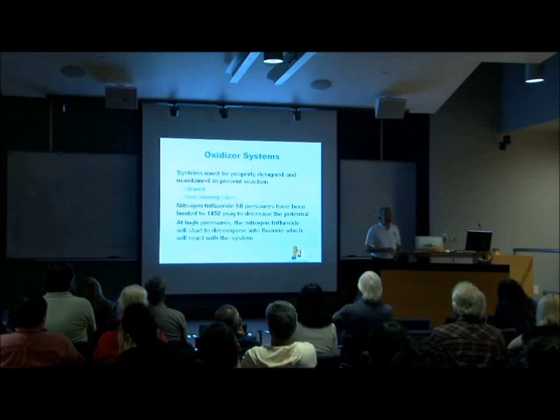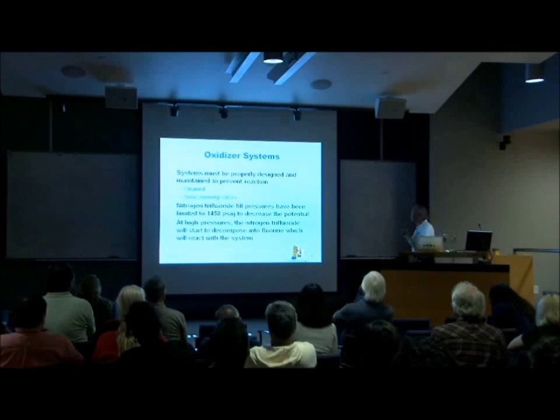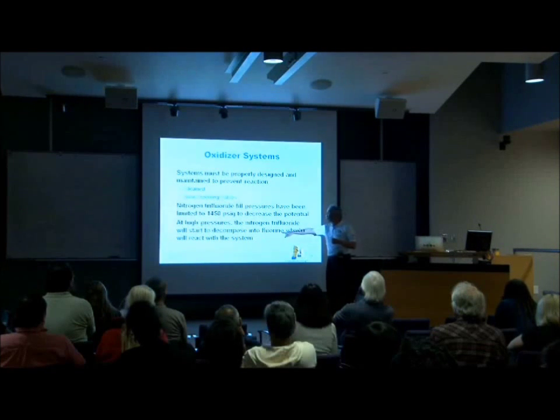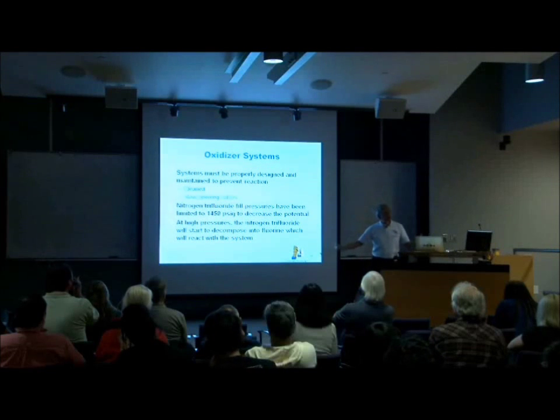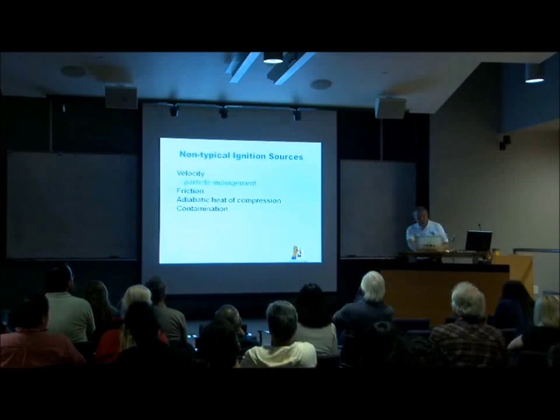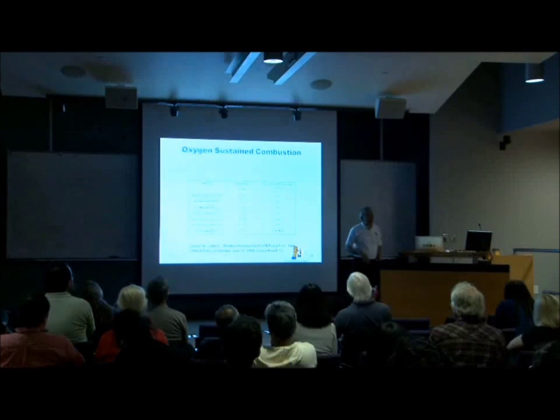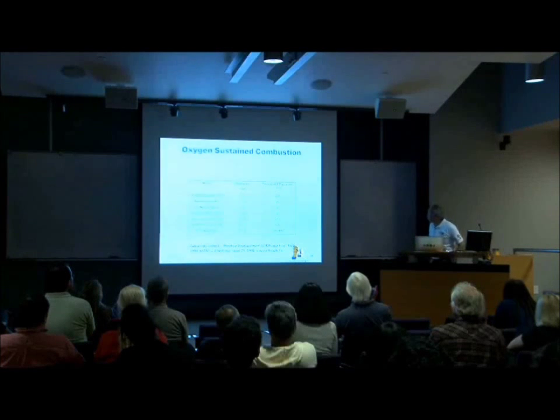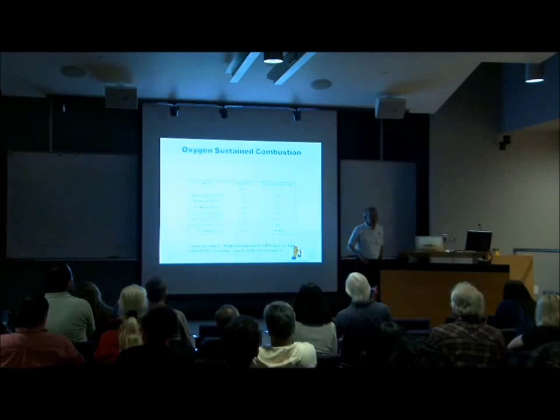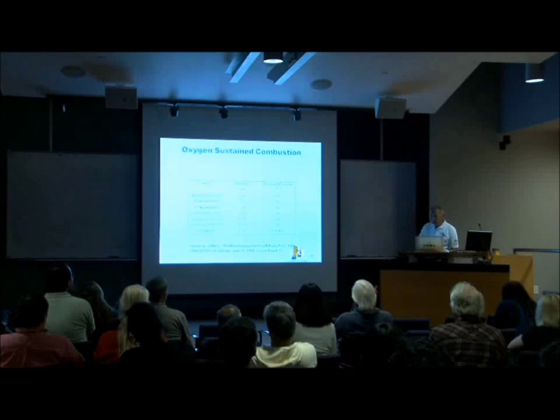Even something as simple as nitrogen trifluoride, an inert gas, but the adiabatic compression heat can get hot enough for it to decompose into fluorine. And you all know that fluorine is a very reactive gas. Oxygen will not react with stainless steel until it gets up to a pressure of about 725, yet aluminum is as low as 25 psi. So material of construction is very important when you're putting together high pressure oxidizer systems.